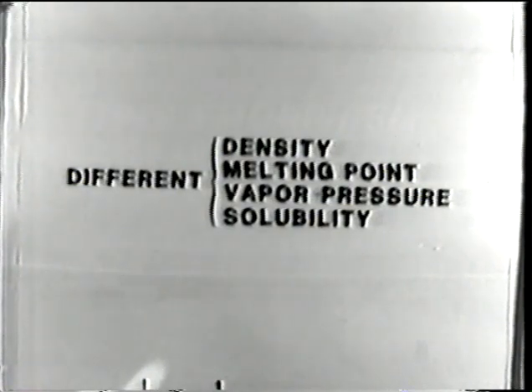The properties most useful to those of us who wish to produce and study polymorphic forms are the usual properties we used to use to characterize and identify compounds before FTIR, mass spec, NMR, and such. I still use density, melting points, and so on, but I also still use the polarized light microscope, PLM. I use PLM because I can see directly what is happening.